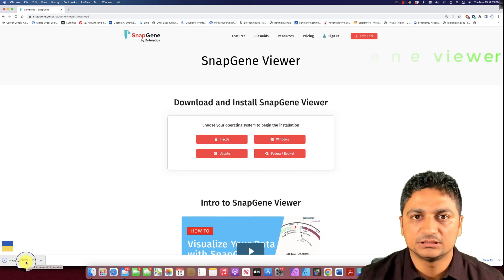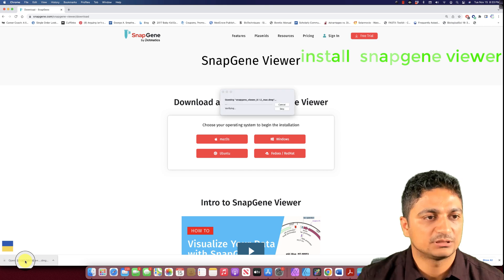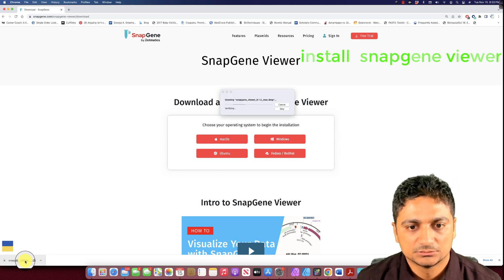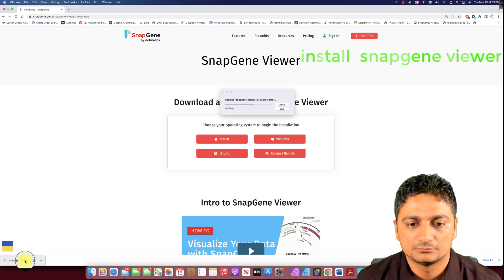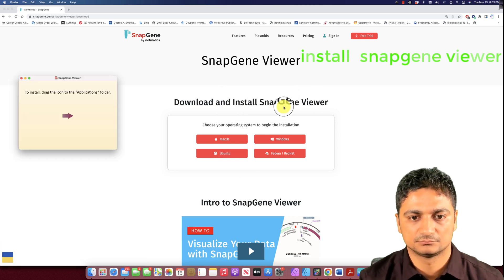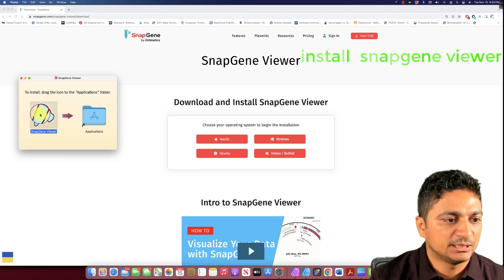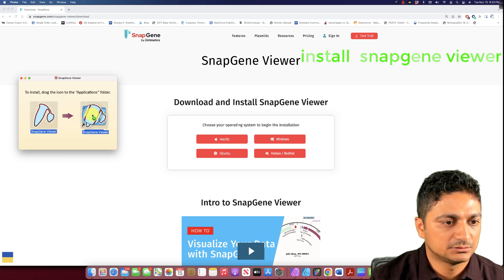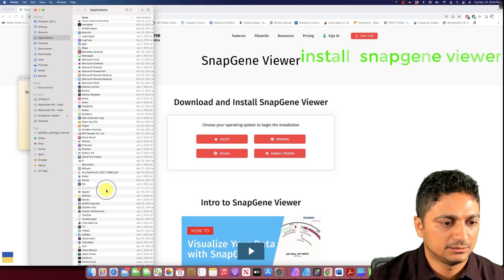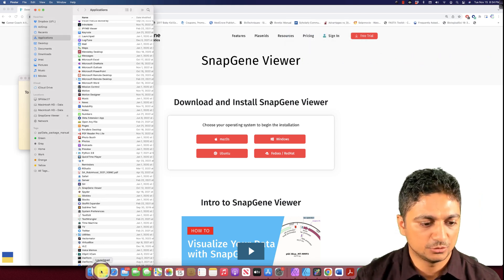The download is complete and I'm going to install it. Let's click the downloaded version — it is now opening and verifying, which might take a few minutes. The installation is complete and I'm going to drag this into my Applications folder.